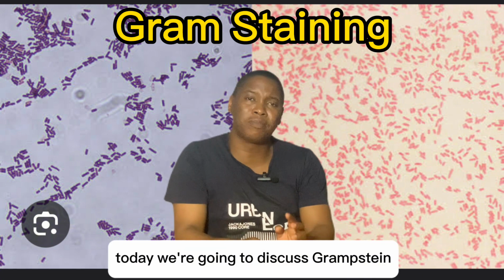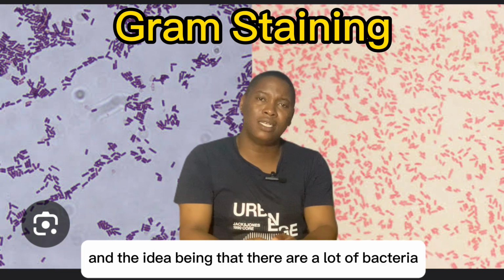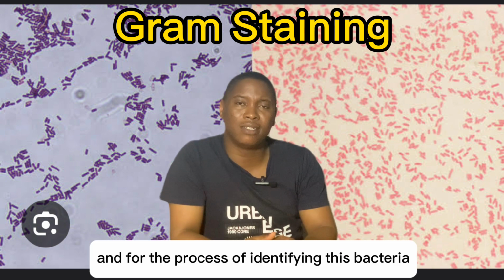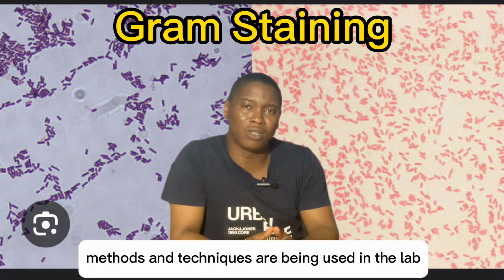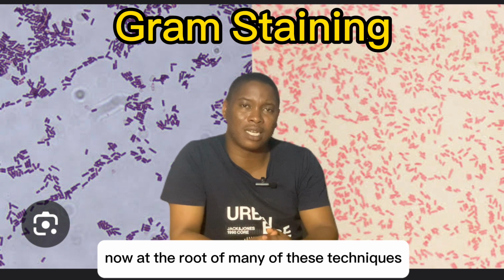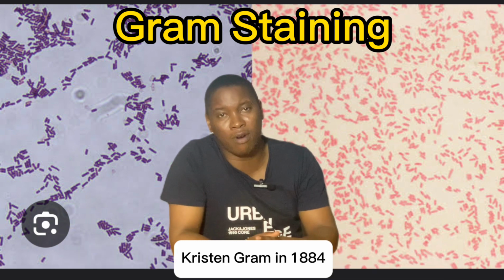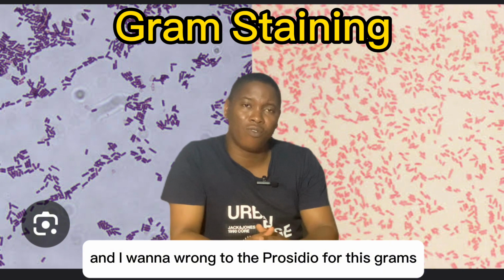Today we are going to discuss gram staining. Gram staining is an important concept in microbiology. There are a lot of bacteria that exist, and for the process of identifying these bacteria, many methods and techniques are used in the lab. At the root of many of these techniques is gram staining. It was designed by a scientist called Christian Gram in 1884, and I'm going to run through the procedure.